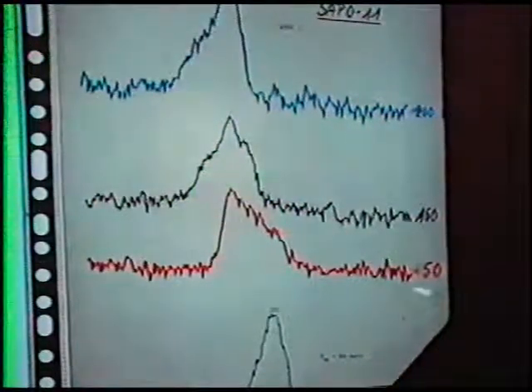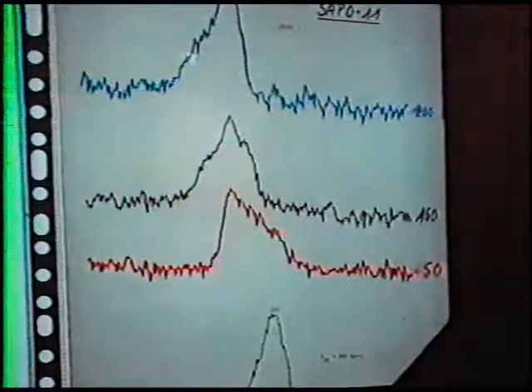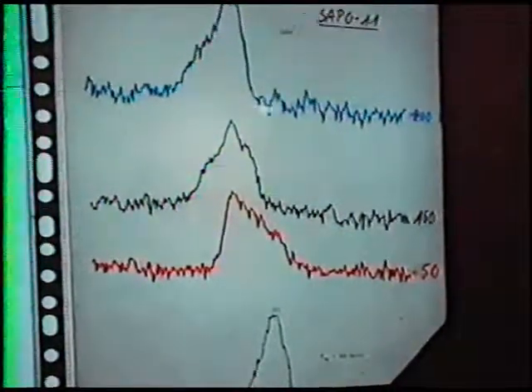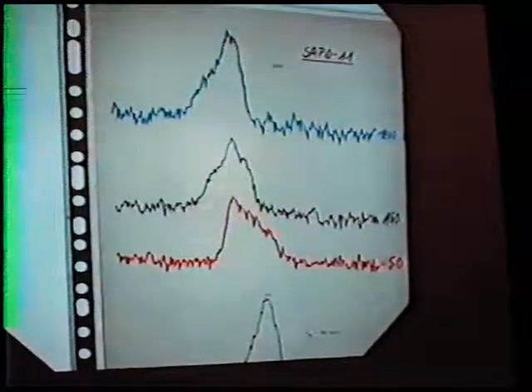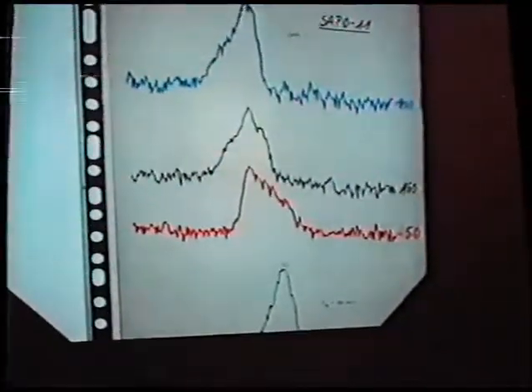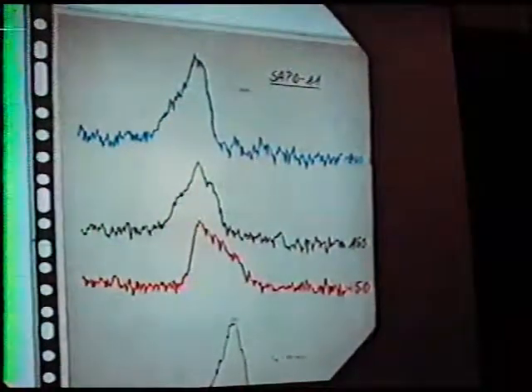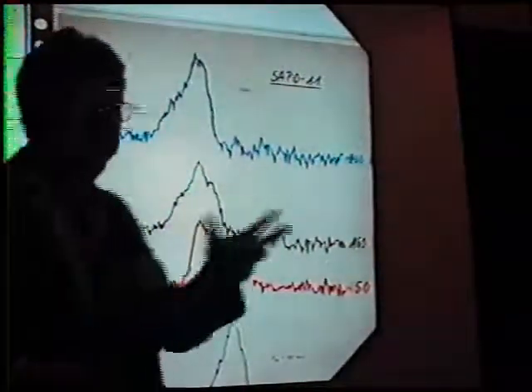At low loading, at a low xenon concentration, we have such anisotropy of the chemical shift. At high concentration, we have changed the axis of symmetry for such chemical shift anisotropy. And of course, at the intermediate concentration, you haven't any anisotropy at all. So you can also use this technique for determining the symmetry of the structure, of course, at a short range. Thank you very much.